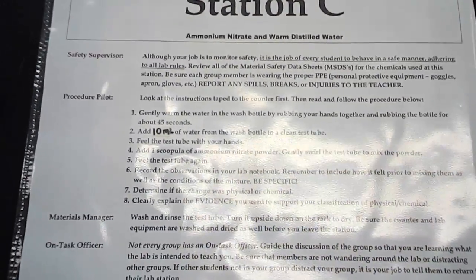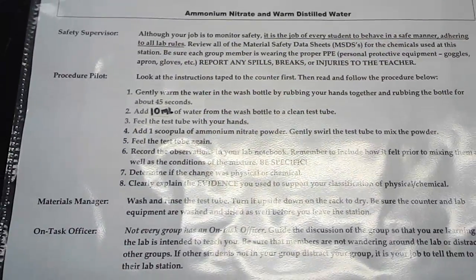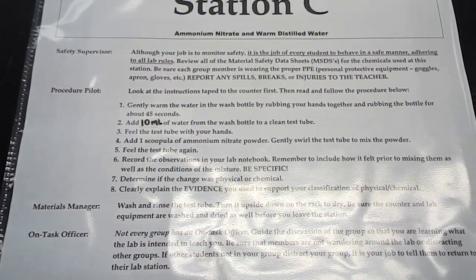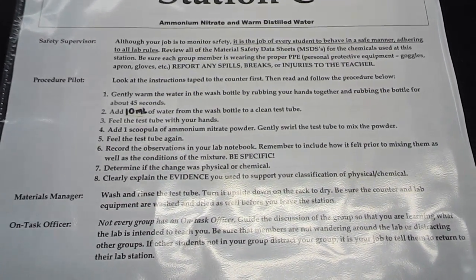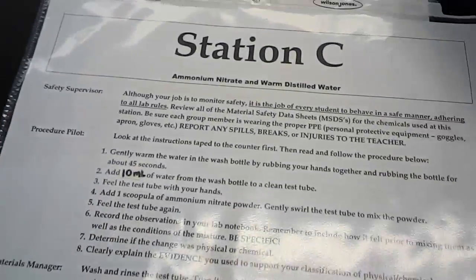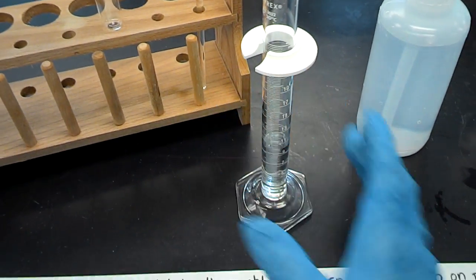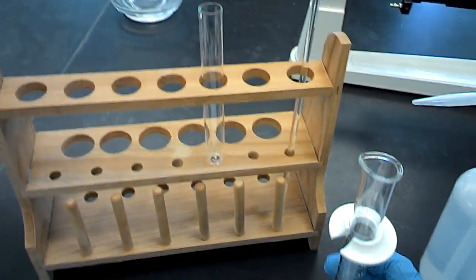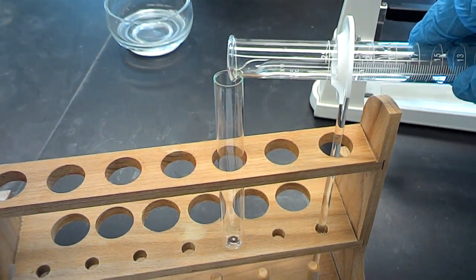Station C is adding ammonium nitrate and warm distilled water. The safety supervisor tells you that you do need all your proper PPE at this station as well. Your procedure pilot will let you know what to do. The first thing is you add 10 milliliters of warm water. So I have 10 milliliters in a graduated cylinder. I've already measured it out. You add it to a test tube. Be careful.